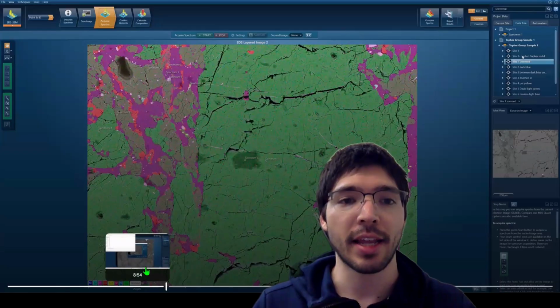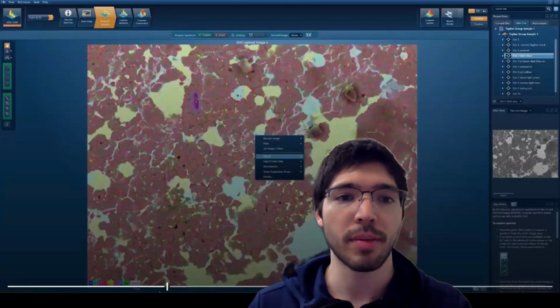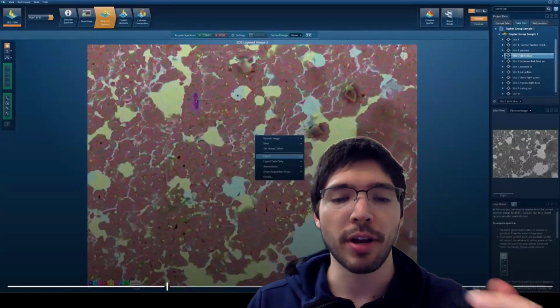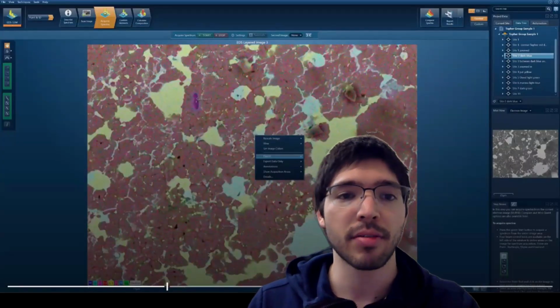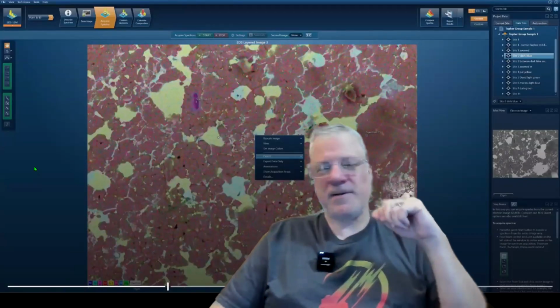and then navigating and ensuring that whether it's uniform throughout different sites when I go through the sample or if it's different. And I always try to collect data points from clean areas, but from representative areas too. Yeah. Very good. Thanks for clarifying that.